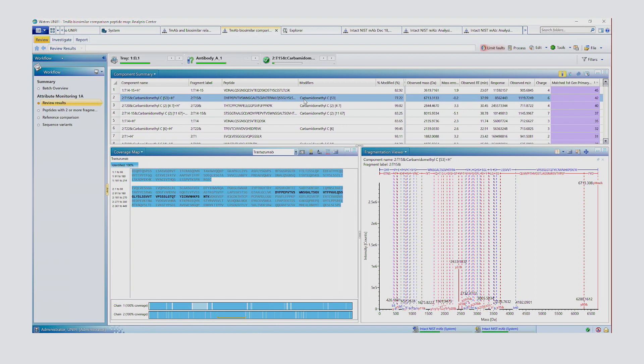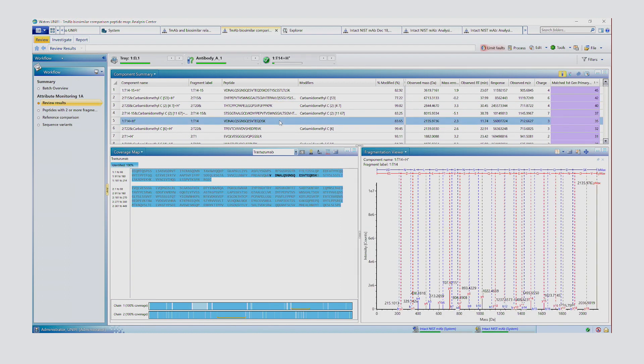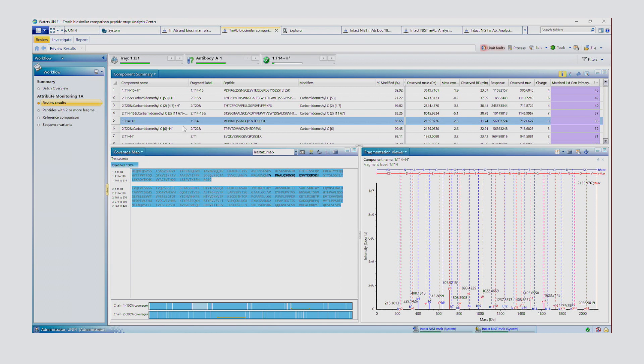So in the review tab, we're looking at the coverage map, which indicates the level of coverage from the tryptic peptides. We have here an annotated fragmentation spectrum. And we have information in the review table, which corresponds to the peptide name, the mass error and the percentage modified.